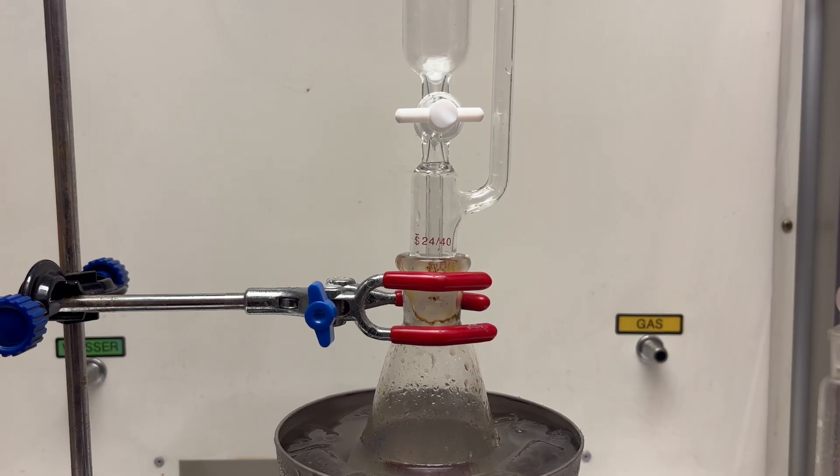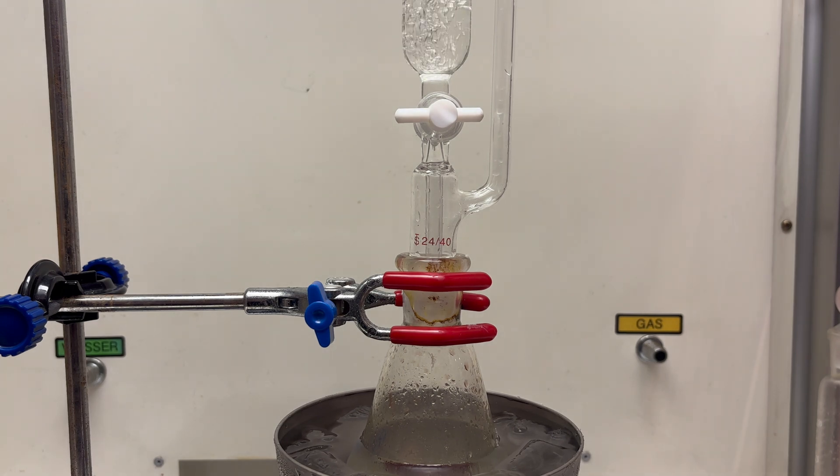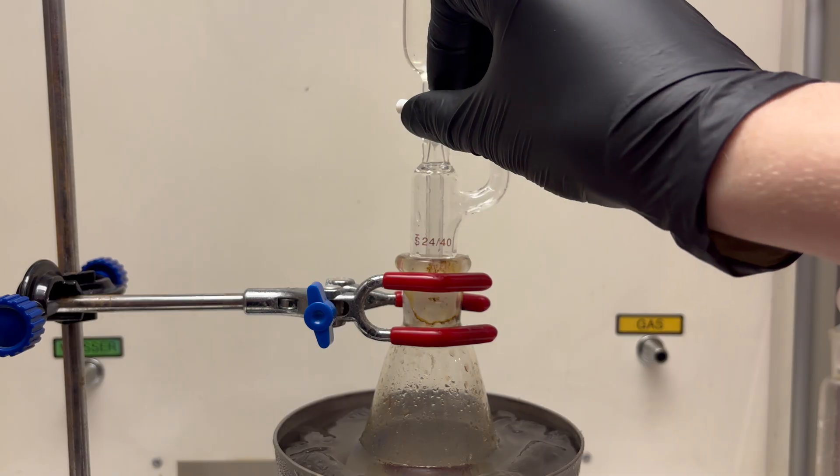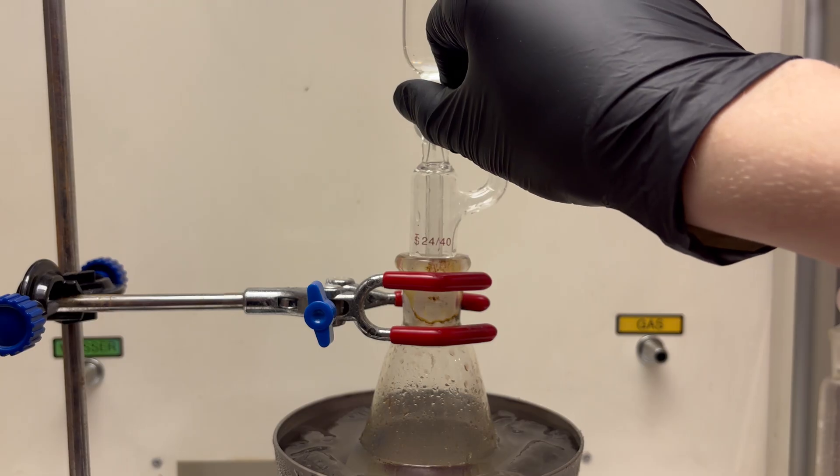After this, 50 milliliters of a 2 molar stannous chloride solution are added into an addition funnel. It's important that the addition of the stannous chloride solution is slow and the temperature is maintained between 0 and 5 degrees Celsius.